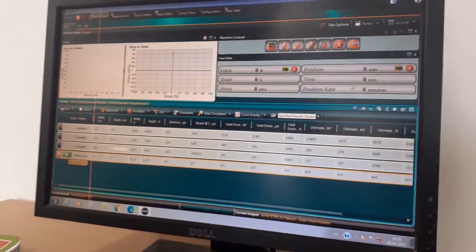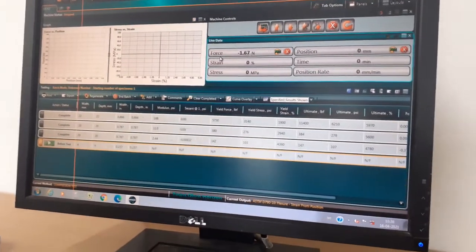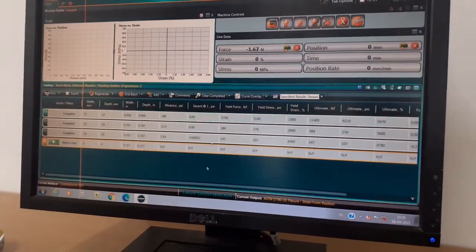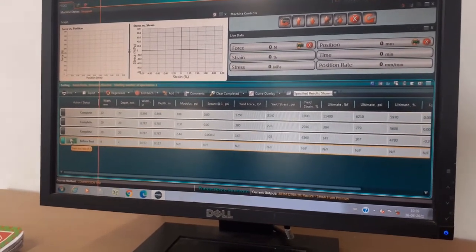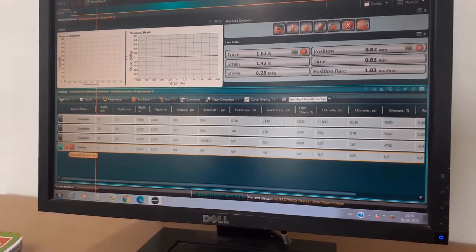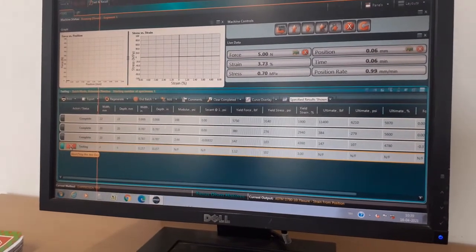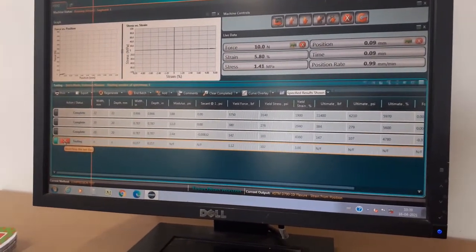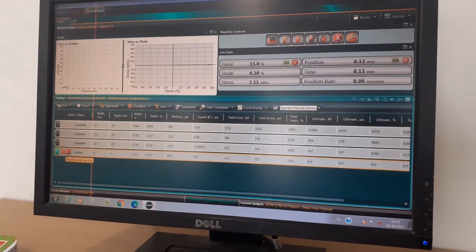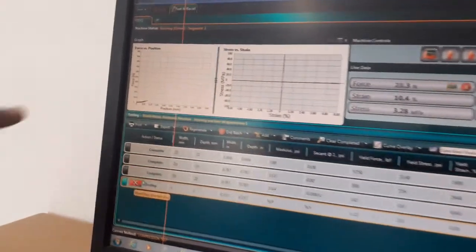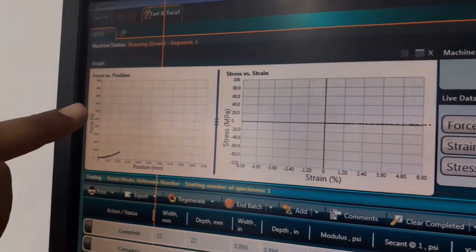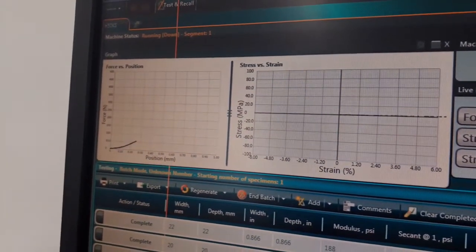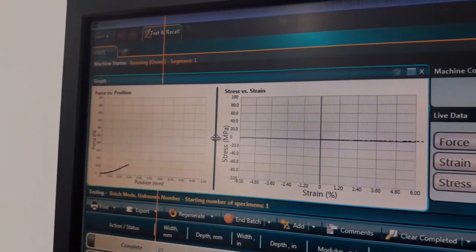All values here are at zero: force and position. Now we start the test. The graph will rise slowly. This graph is for the force versus position.